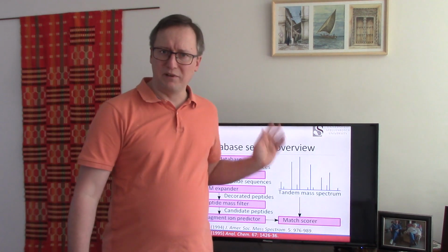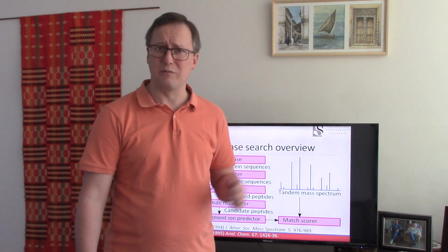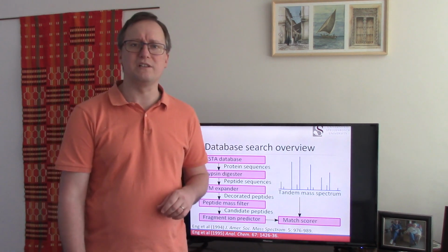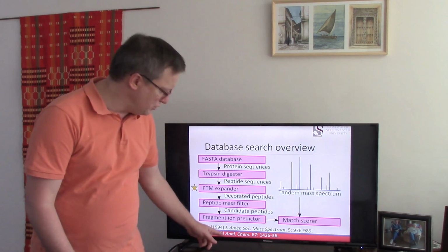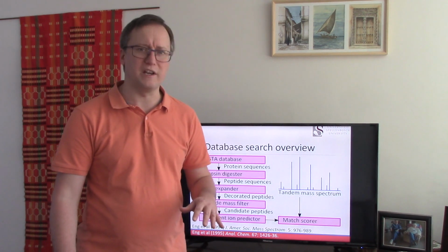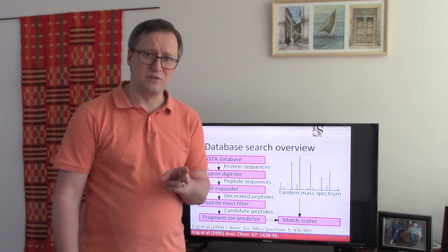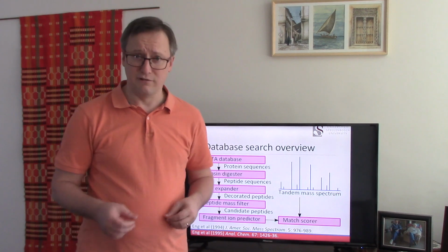So I think many people have seen this diagram now. If you've already watched the lecture on proteomic identification, this should come as no shock. But I want to spend a little time talking about this post-translational modification expander. There are two original papers for SEQUEST. The 1994 one sometimes gets cited, and we often see people citing the 1995 one.